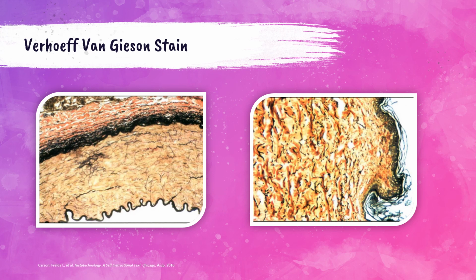The right-hand photograph is the skin section that is stained with Verhoeff Van Gieson stain. This is actually a bad staining example. Recall that the collagen fibers should be red when properly stained. So it's a yellow-orangish color in this photo. So this means that the picric acid used in the stain was not saturated. So this one should be restained with properly prepared stain.